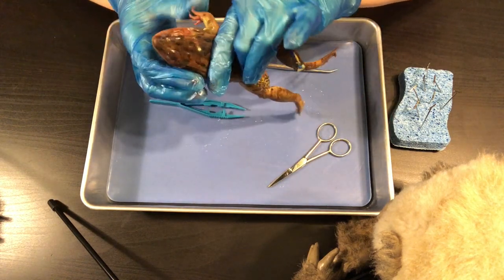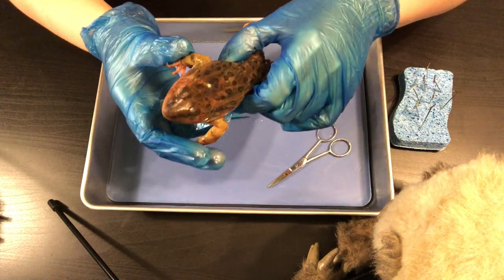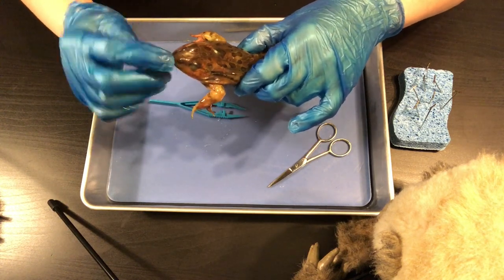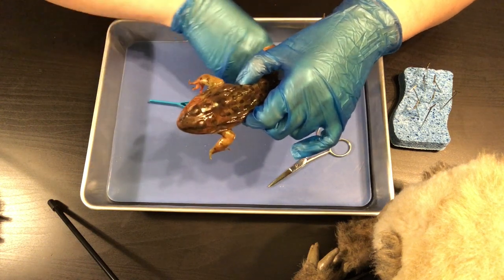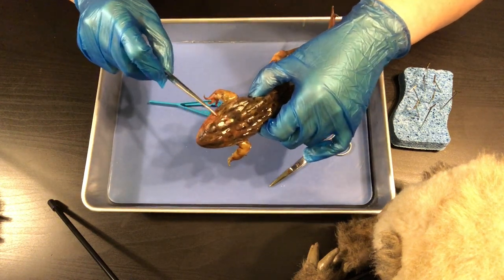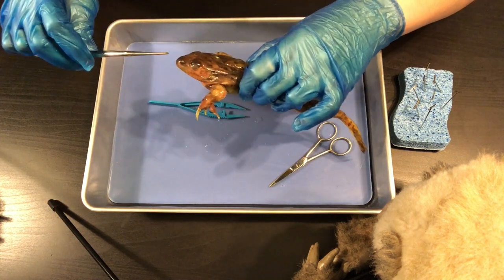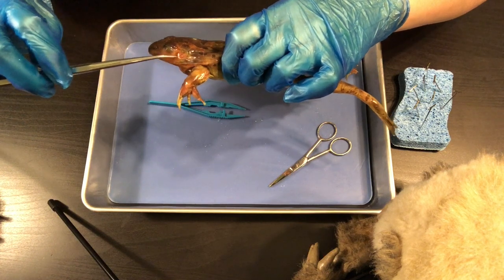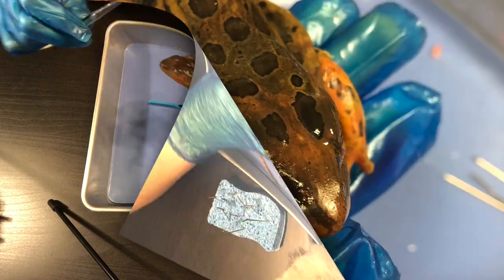Some other things to point out on the outside of the head: you can see the nostrils here — the nares — and then you can see their eyes as well. Right here, using my probe, you can see what's called the tympanic membrane, which is basically the frog's ears. Vibrations hit the tympanic membrane so that they can hear things.